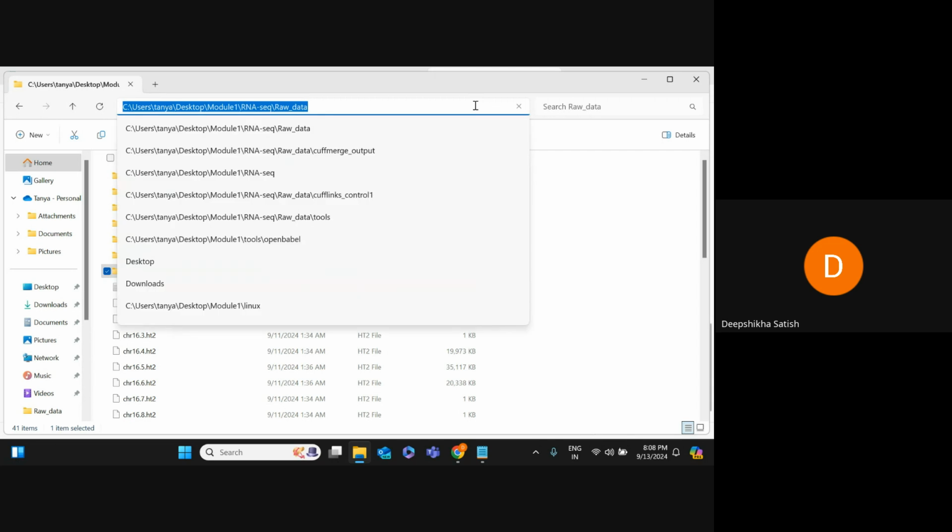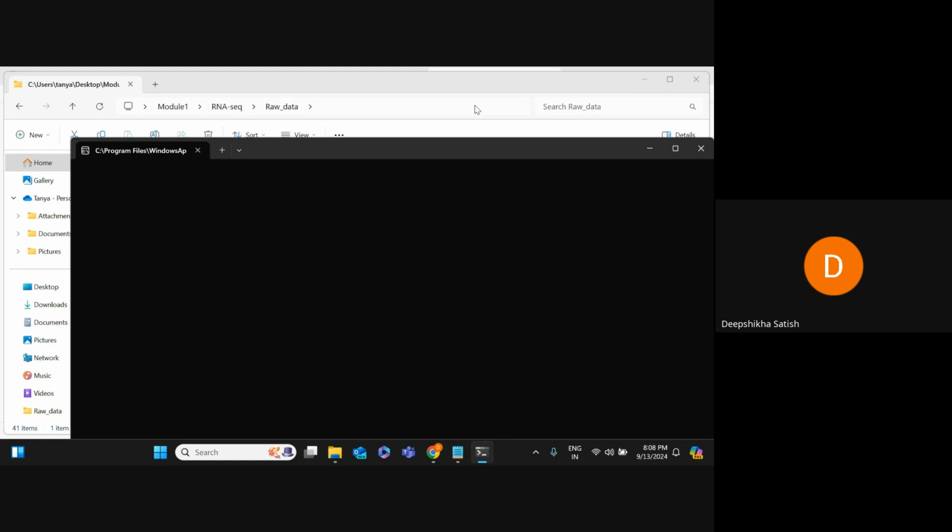and from this raw data you need to open a new terminal again. And there is one command, you just write here sudo, give the space, nano, space, slash etc slash bash.bashrc file. So what is sudo? It is root access here, and nano is a text editor, whereas this etc is the folder where the bashrc file is written.